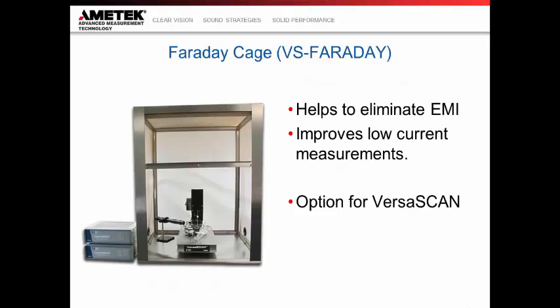Another option that we have is the Faraday cage that encloses the entire base. So we can put all the measurement, like all the samples and positioning system, inside of a large Faraday cage. And this is going to improve low current measurements and eliminate EMI noise.